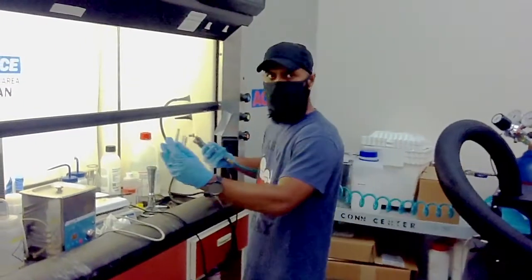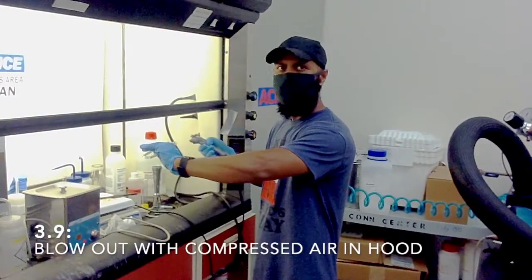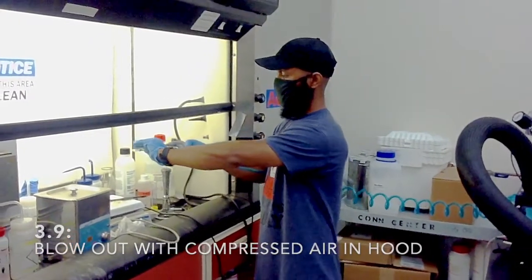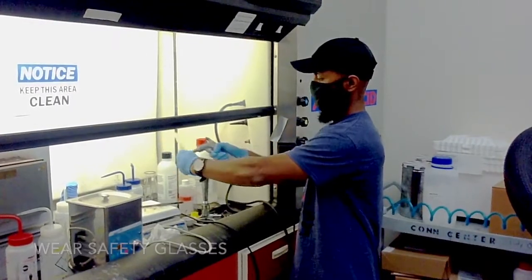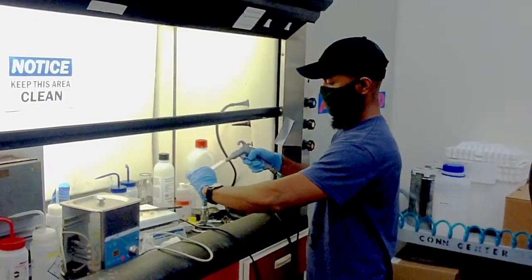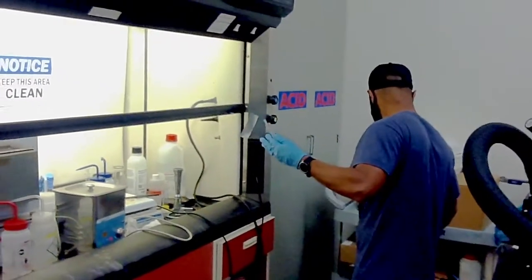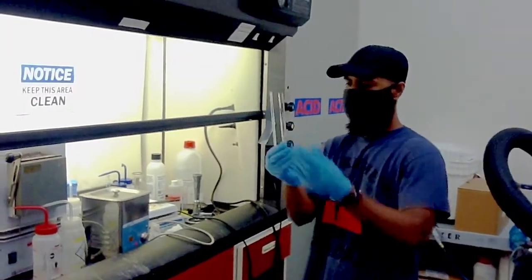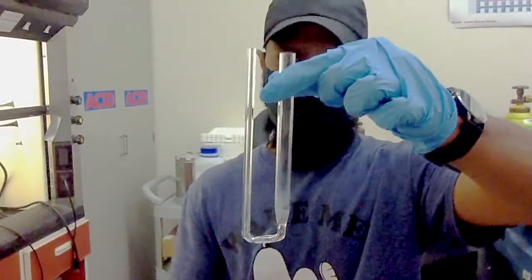Once we wash it, we'll blow some air through this tube, so all the solvent will come out. Now you can see it's completely clean and dry inside. It's ready to run another set of experiments.